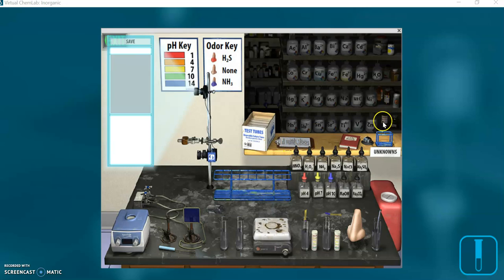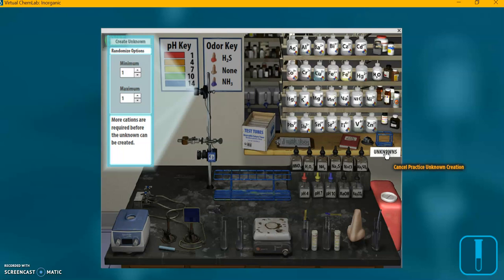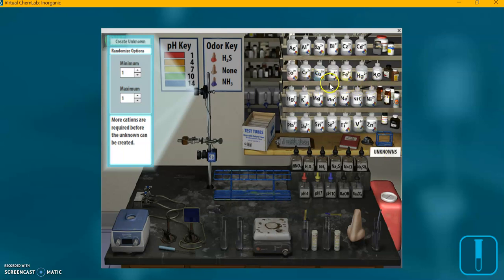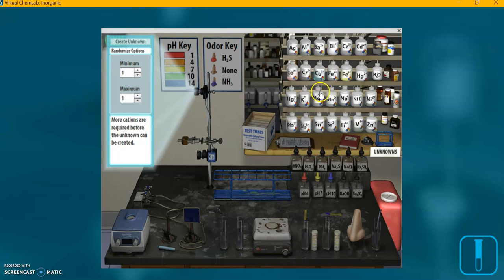So on the right side of our virtual stock room here, we have a label unknowns. I'm going to click on that, and that opens up, activates these bottles so they're ready to be used. And I'm going to create a test tube with an unknown in it, a practice unknown. So I'm going to click on the chemicals we need.